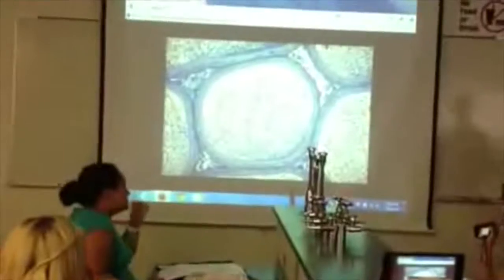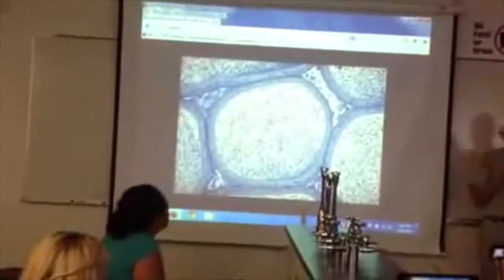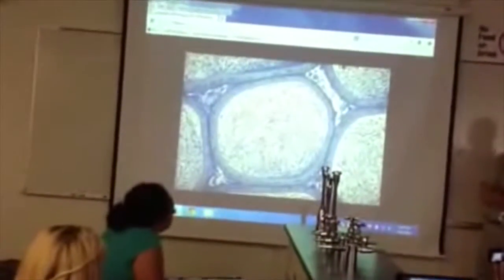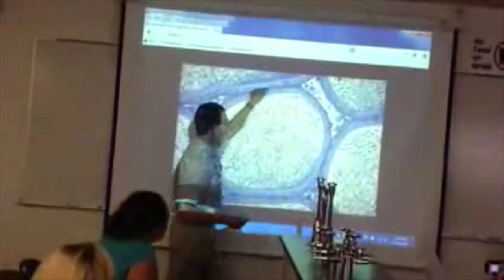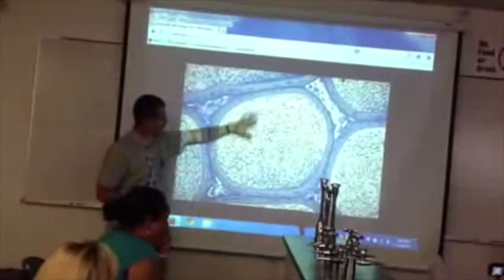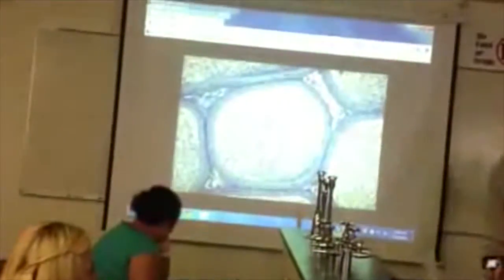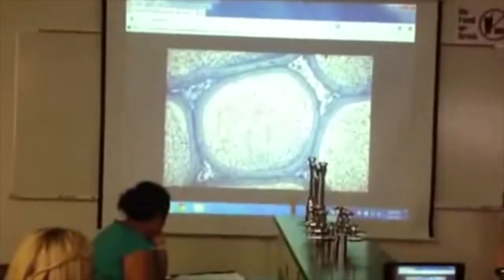Is this a boy or a girl part? It's a boy. Okay, we're good. It's got tubes, right? So there's only two options for tubes. Testis or epididymis. Which one? Epididymis, because I have big tubes, only one layer in the ring, lots of sperm, lots of white space. So that's not a testis. Testis have multiple layers.